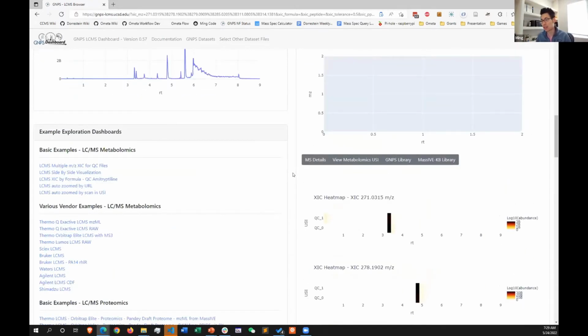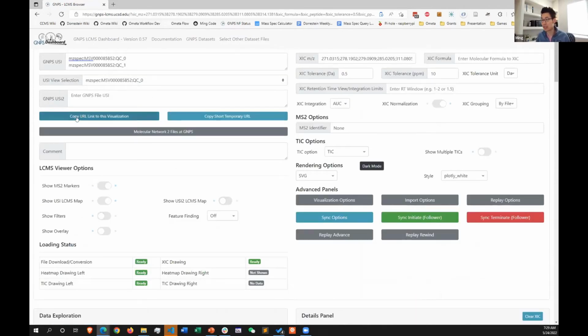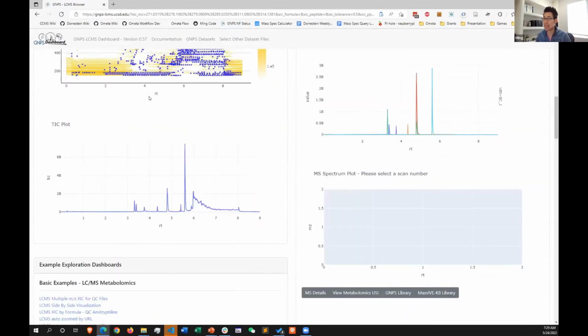And then the nice thing, especially if you're running a bigger lab, one of the things that I think is pretty interesting is if you are the supervisor and somebody's running something, they can send you a daily report as a link to this visualization. And then you can look at all the QCs run the previous day and see, is that within bounds?